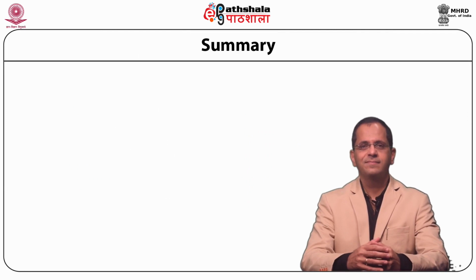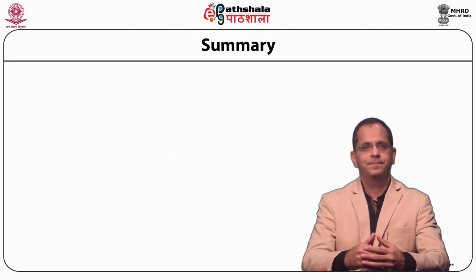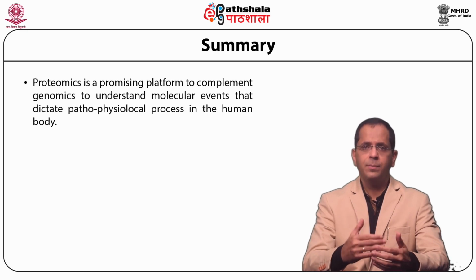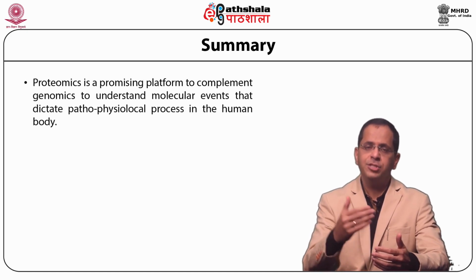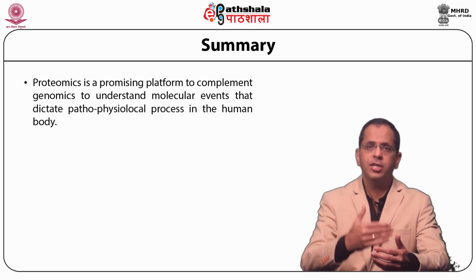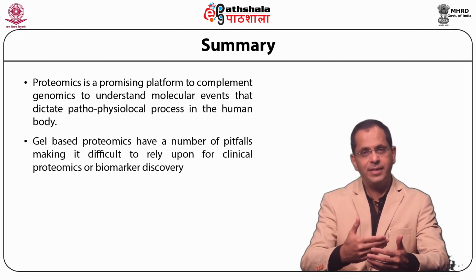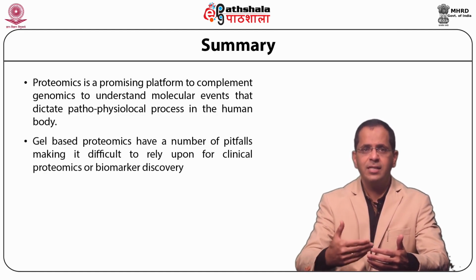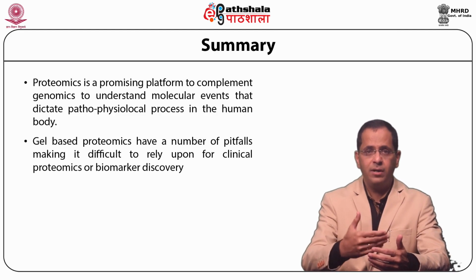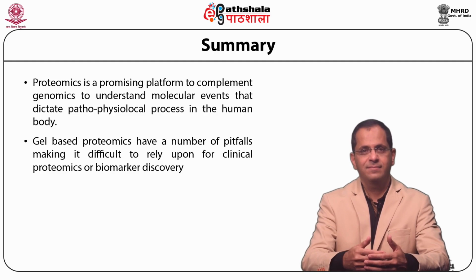So students, let us now summarize what we have learnt in this particular module. Proteomics is a promising platform to complement genomics to understand the molecular events that dictate pathophysiological processes in the human body. Gel-based proteomics has a number of pitfalls, making it difficult to rely upon in clinical proteomics or biomarker discovery.